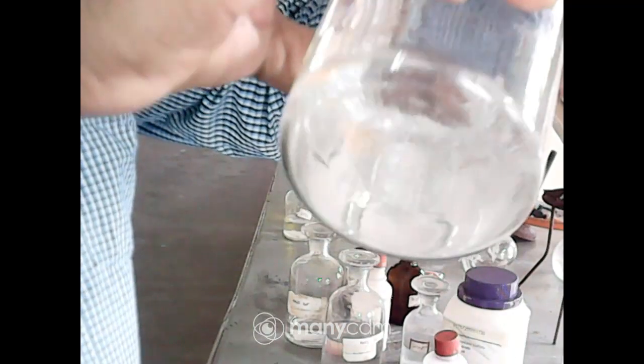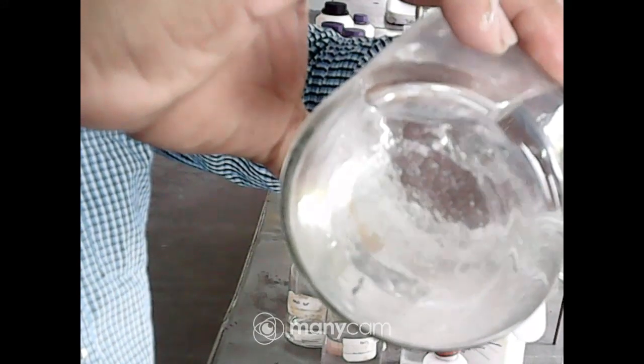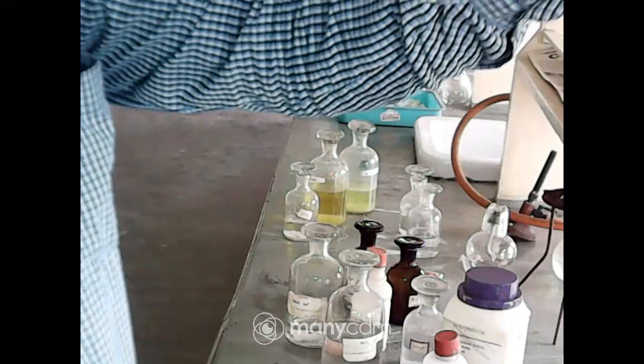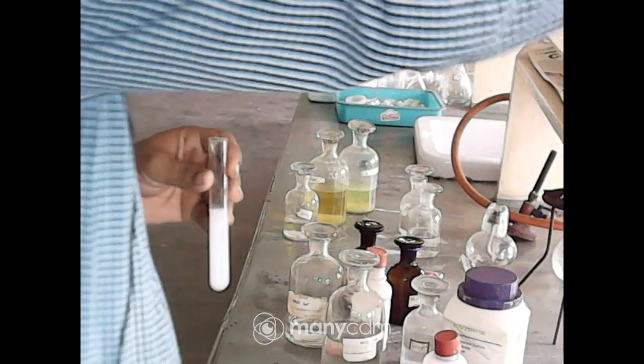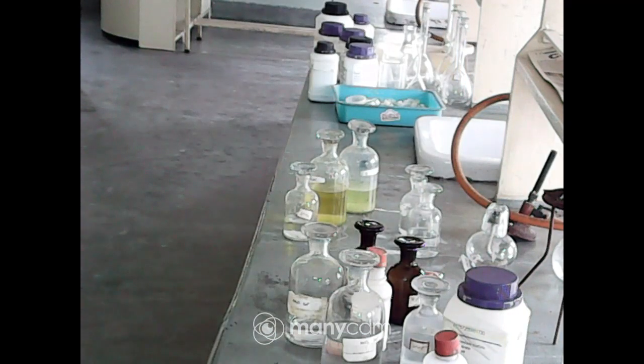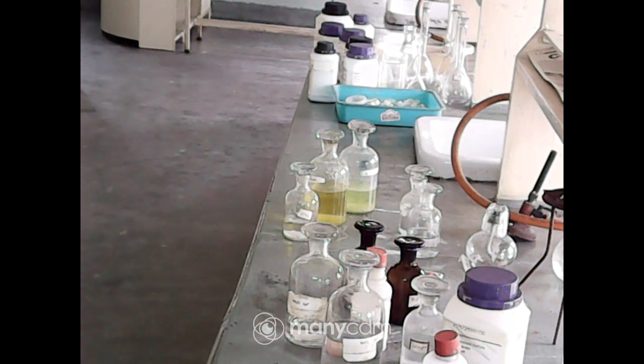Now I am adding it to check whether it is dissolving or not. You can see that there is only an increase in the volume, but the PPT is not dissolved. So these two tests confirm that your sample contains aluminium sulfate. Okay, you need not perform the other tests.